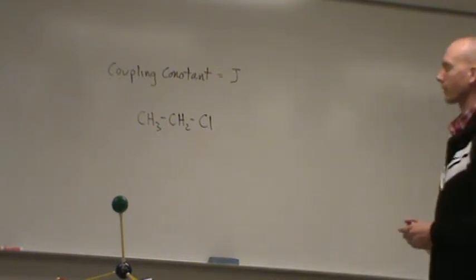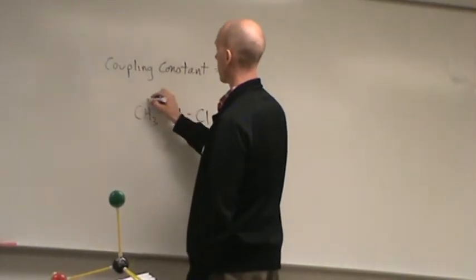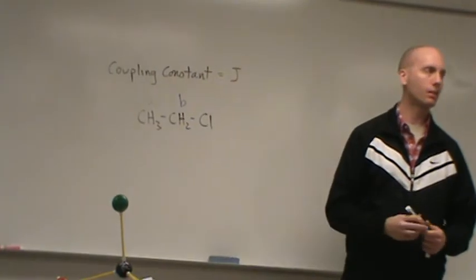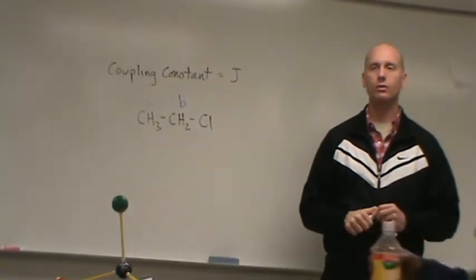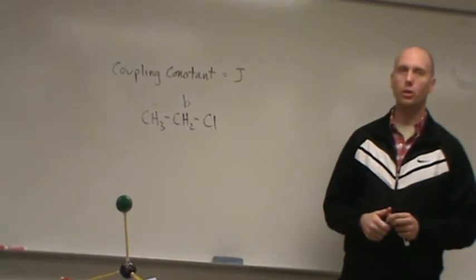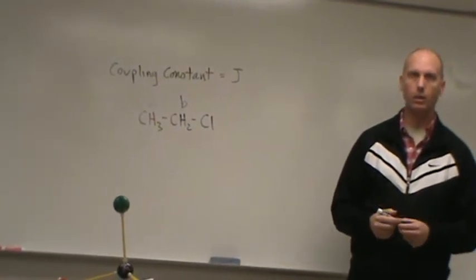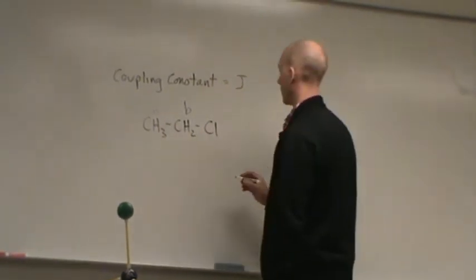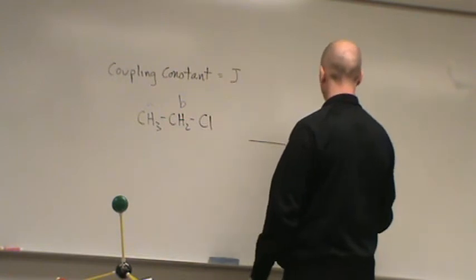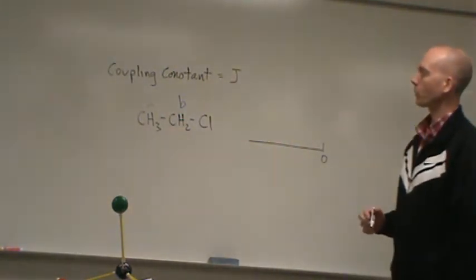Well, again, very quickly, we have 2 sets of hydrogens. Maybe call this A and this one B. Okay? So, which of those 2 will be more downfield? The B. Hope I did not hear someone say A. Okay. So B, more downfield, what will B look like?